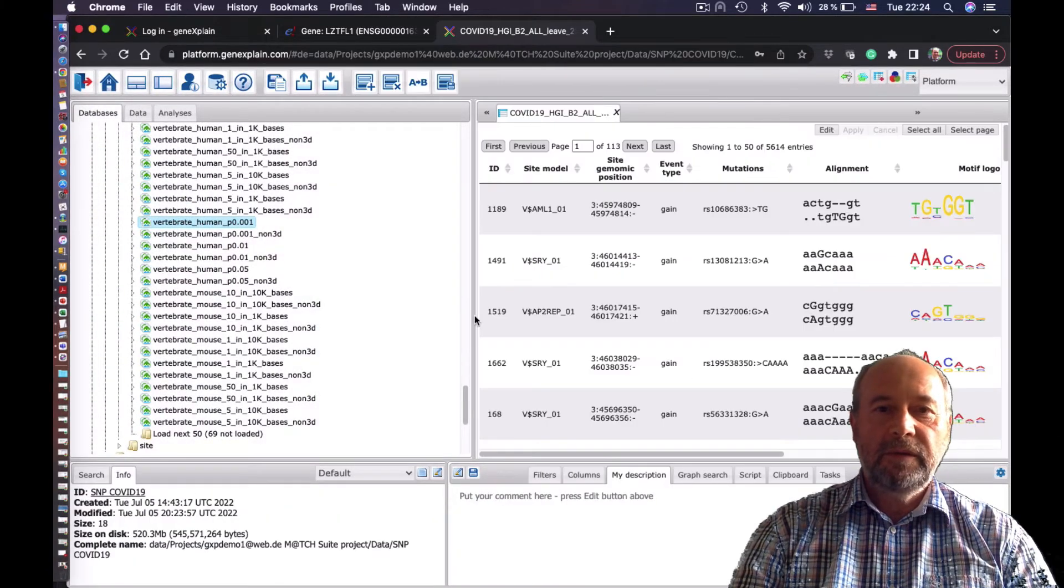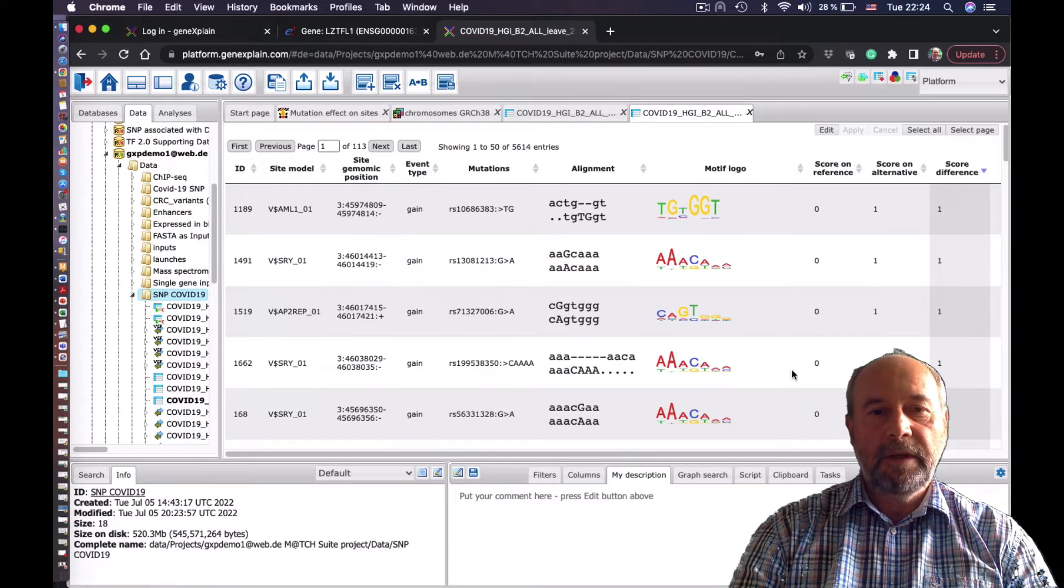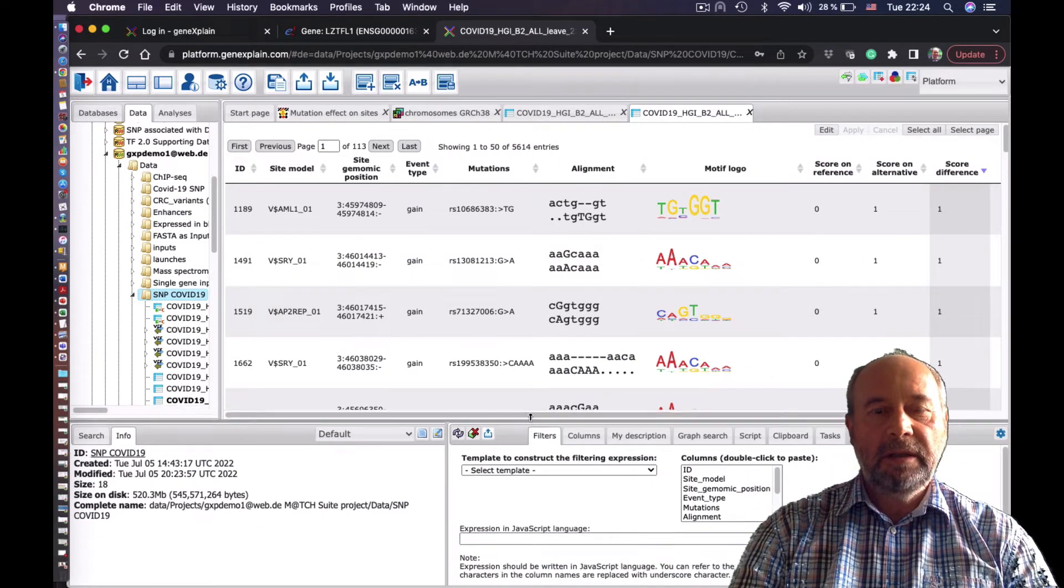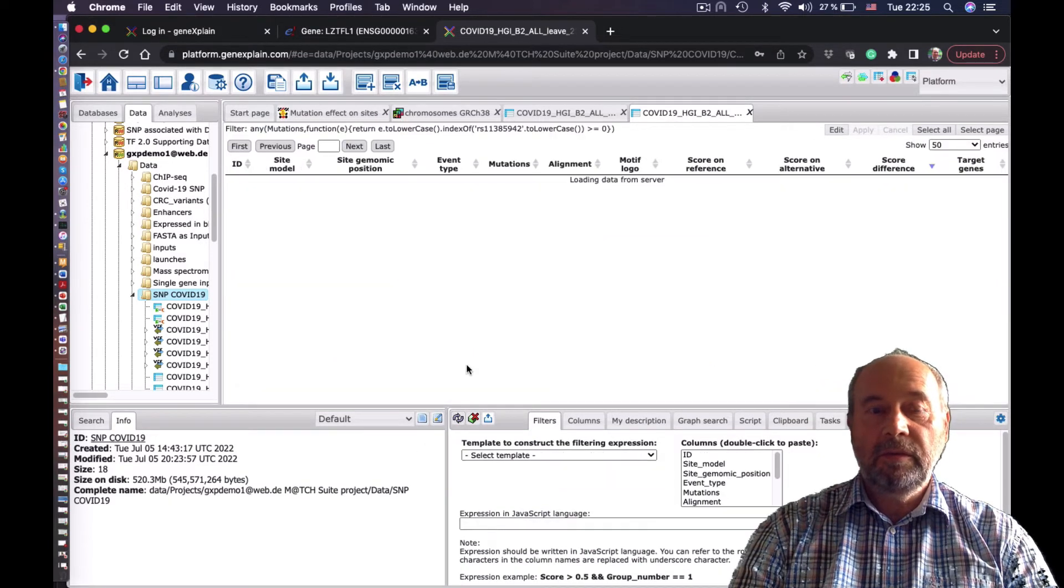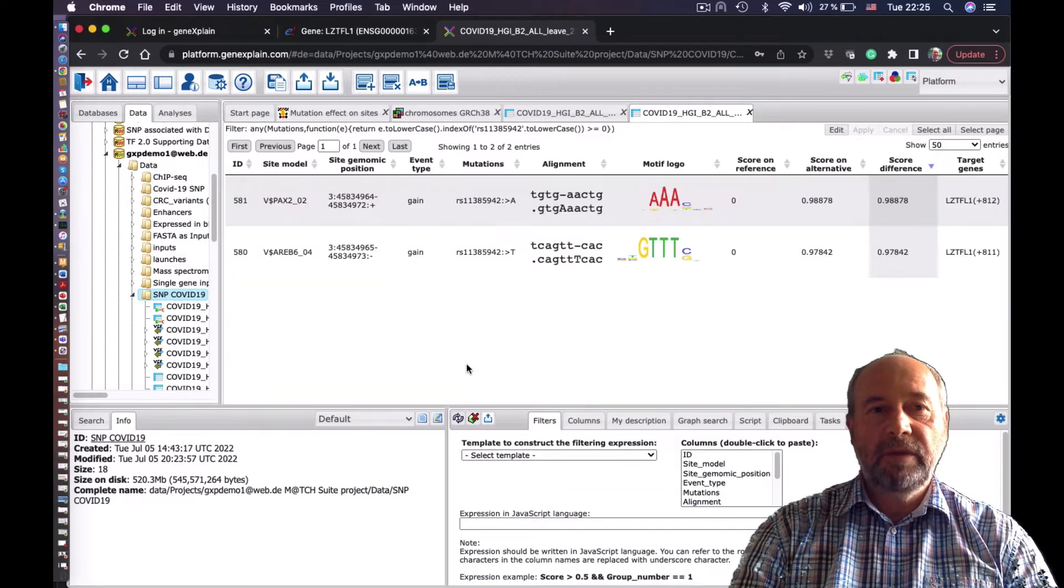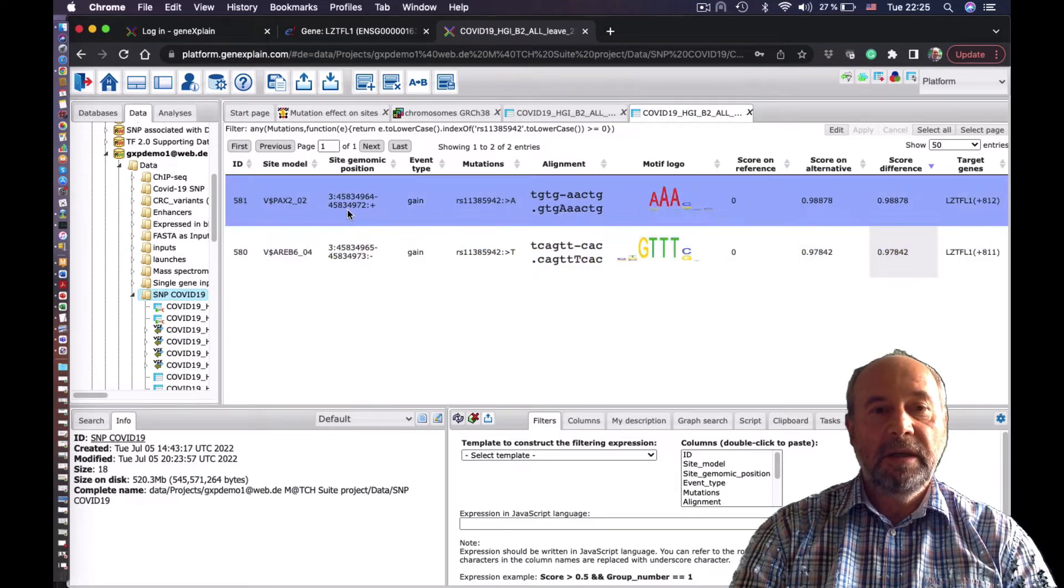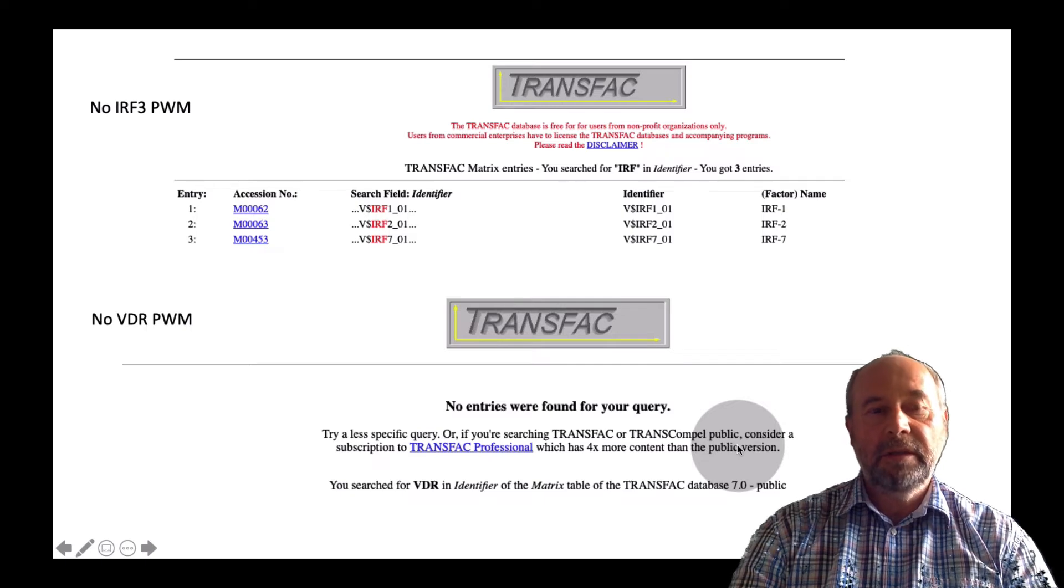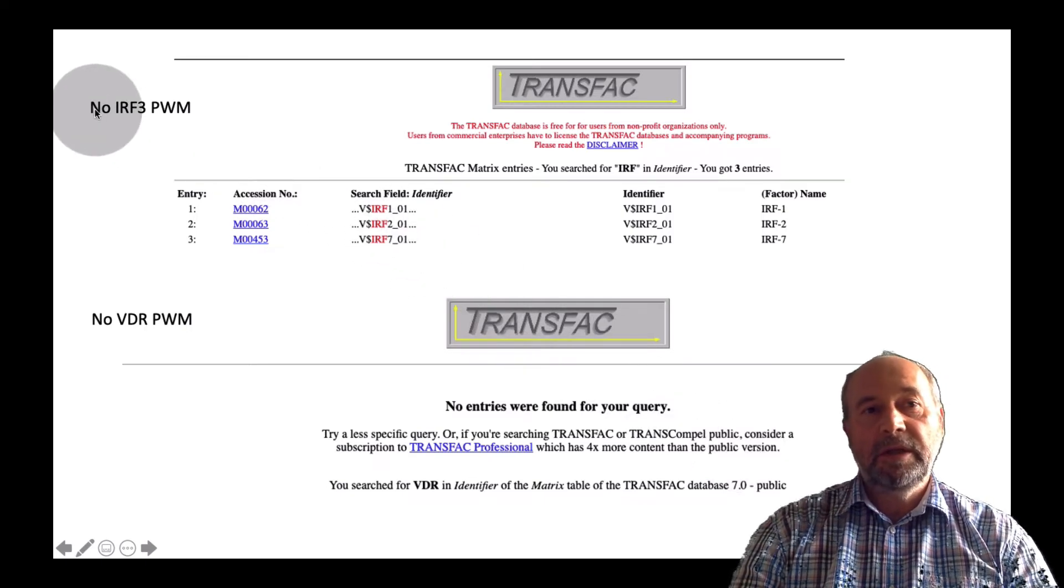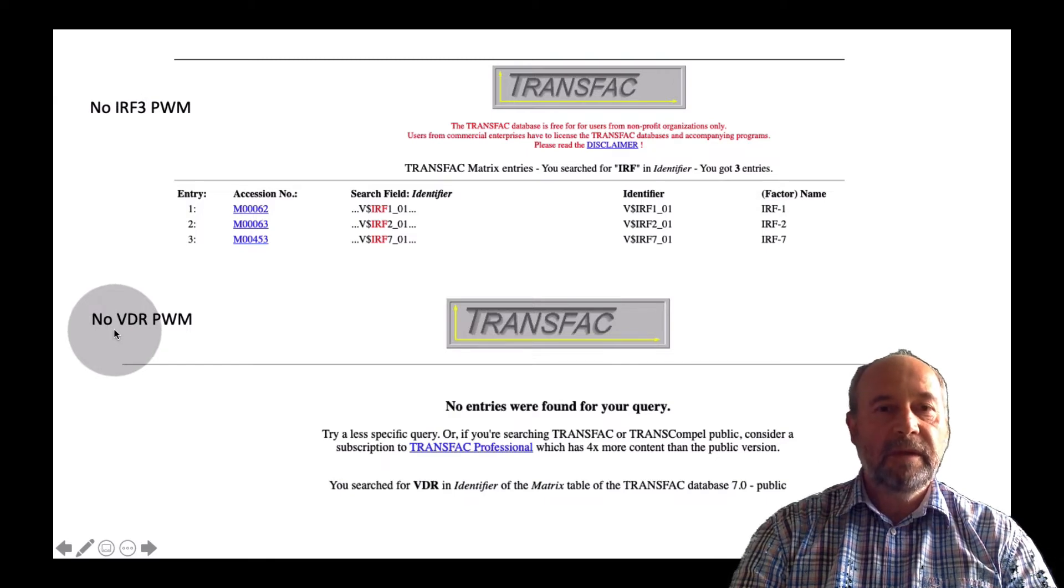So if you search for that same SNP in the output, we see just two binding sites which were predicted using Transfac database. And no IRF3 and no VDR were predicted, reasonably, because there are no IRF3 matrix in Transfac Public and no VDR matrix in Transfac Public.